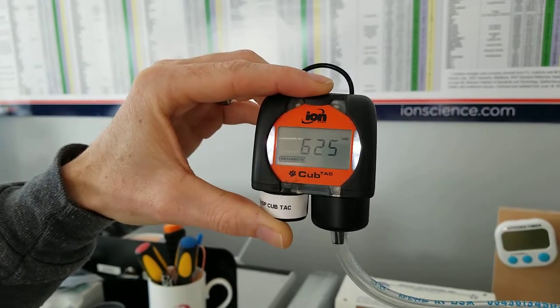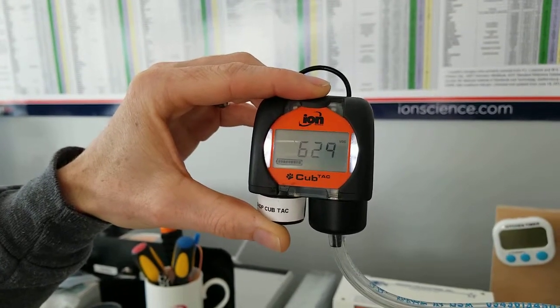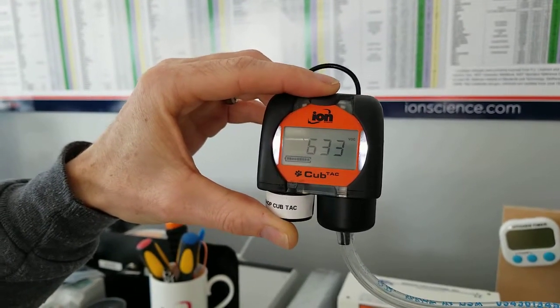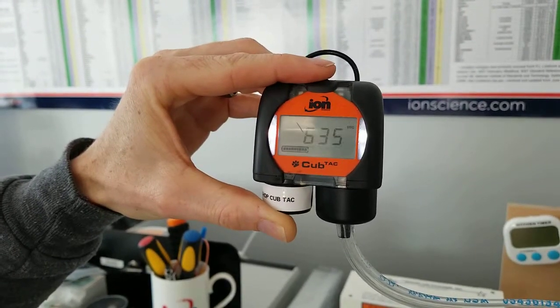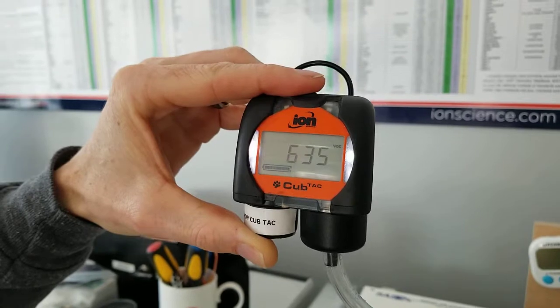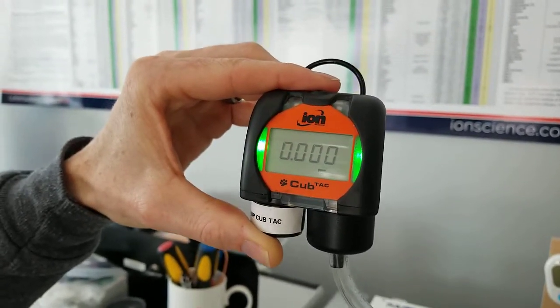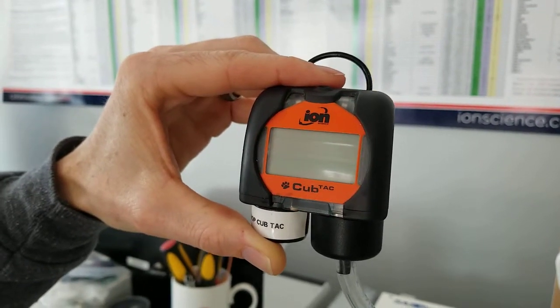A few more seconds and we're really getting there — changes of one or two at a time. The signal is now pretty stable, so we press the button once. It flashes a couple of times while the instrument is learning the calibration. The screen then reminds us of the current response factor.